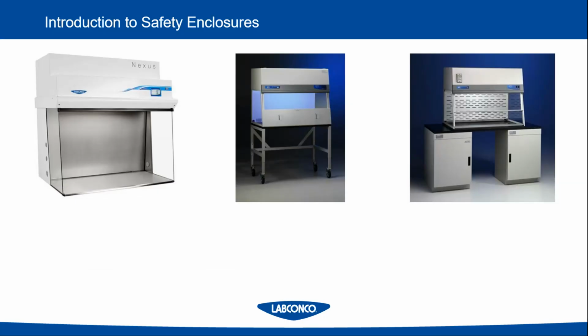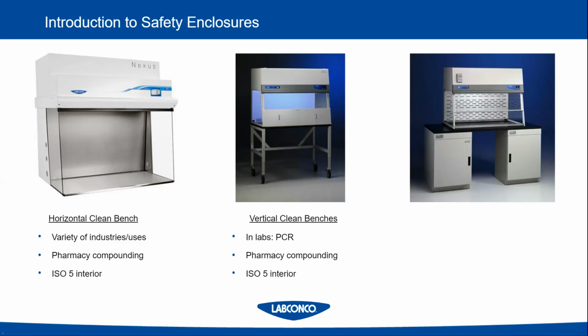And here are some examples of different laminar flow or safety enclosures. On the left is a horizontal clean bench, and you'll see that large screen on the back wall. That's actually a HEPA filter behind that diffuser. These are used in pharmacy compounding, sensitive electronics, manufacturing, things like that.